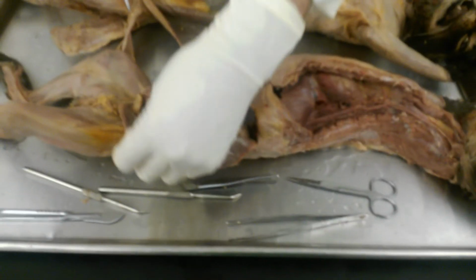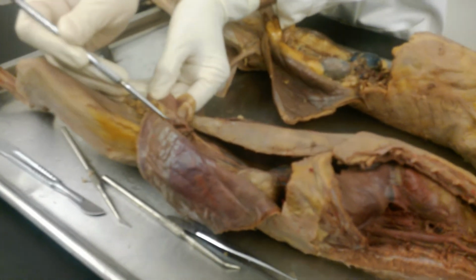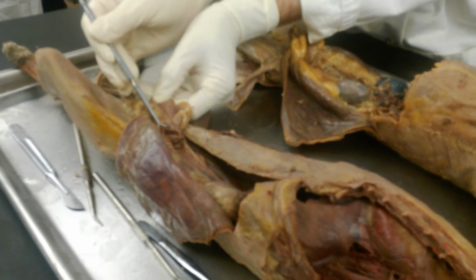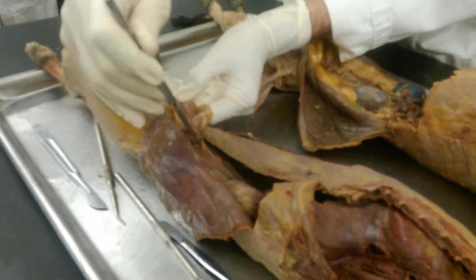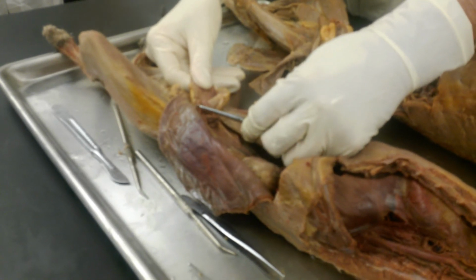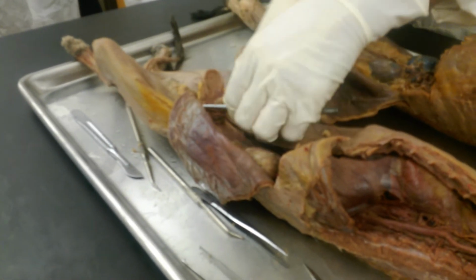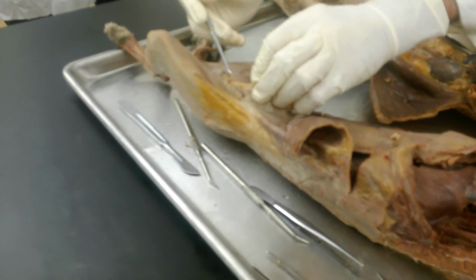This cat, this one here, is a male. So if you look, here's the bladder, here's the ureter going into the bladder, and looped over the ureter is that structure right there. That's the ductus deferens. And if you look in there deep enough, it joins to the urethra at the ejaculatory duct. If you follow the ductus deferens in the opposite direction, where is it? Right there, you find that it comes together with a vein and an artery, testicular vein, and they all together disappear through the wall of the abdomen, through the inguinal canal, and then they come out on this side.